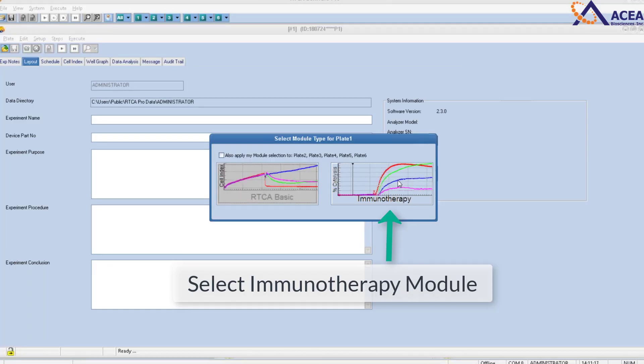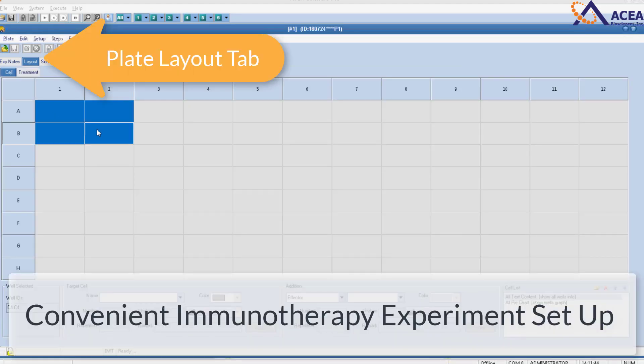First, select the immunotherapy module. In the plate layout tab, set up your immunotherapy experiment.